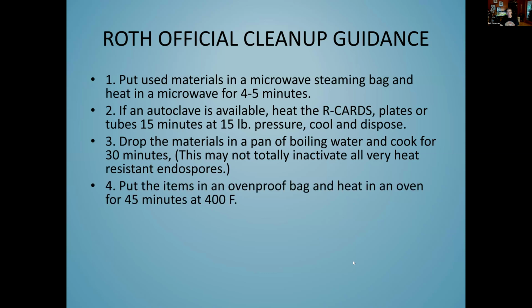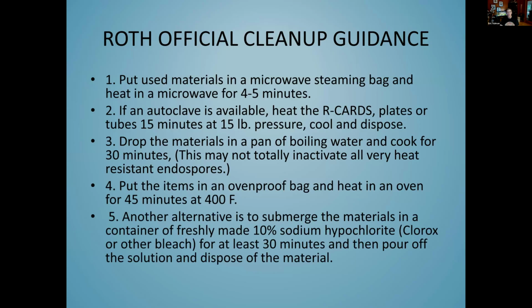And you can also use either a microwave, an autoclave, boiling water, an oven-proof bag. There's a whole host of methods that they recommend. Again, I think this is really if you have a high volume of cards and you're doing this in a laboratory. So far, from our program standpoint, we don't believe that these are any more hazardous than other things that go into the waste stream. So once they've been incubated, you can dispose of them as household waste.